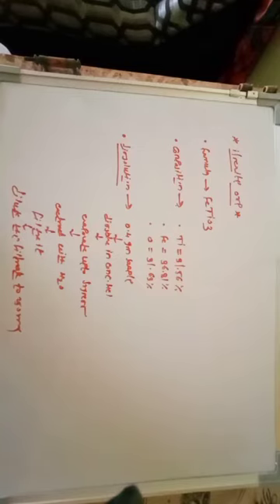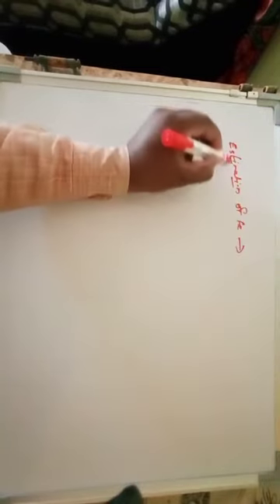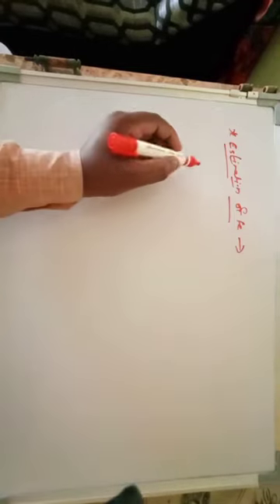We are very much interested in the diluted solution because we determine only Fe and titanium from this ilmenite ore. So after dilution, let us go for the further estimation of Fe. Let us discuss the procedure for estimation of Fe. How will you find out the percentage of Fe from the diluted solution?